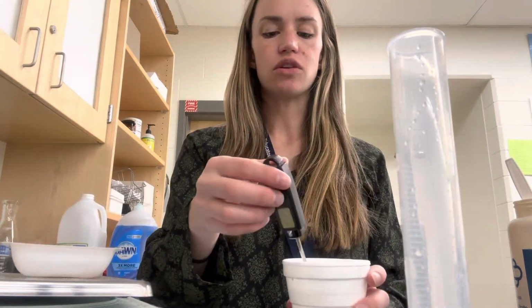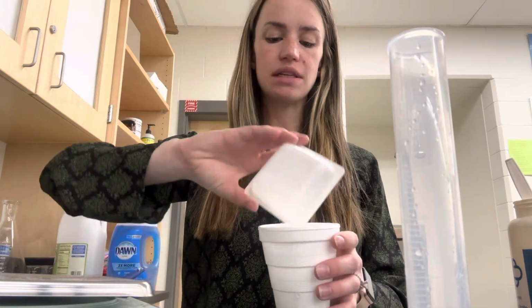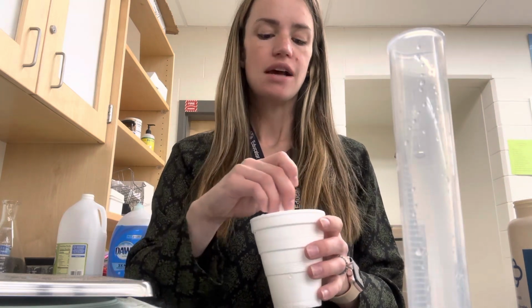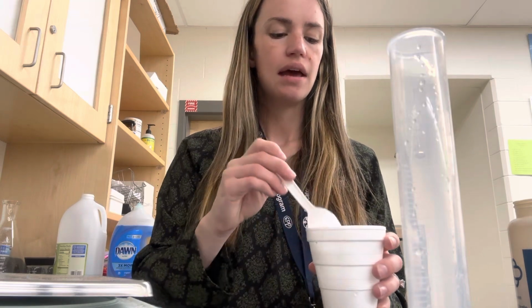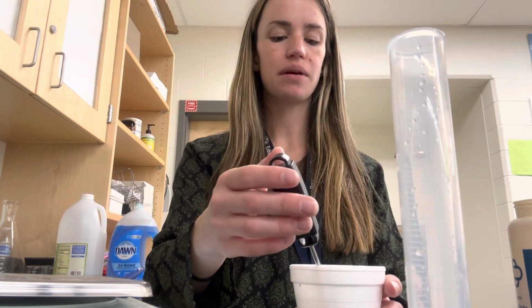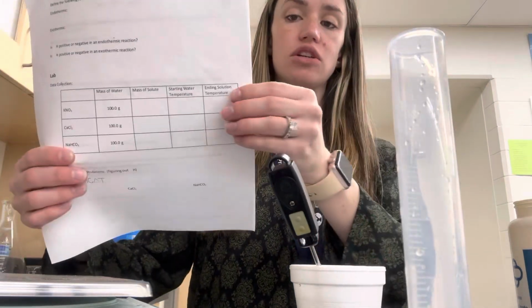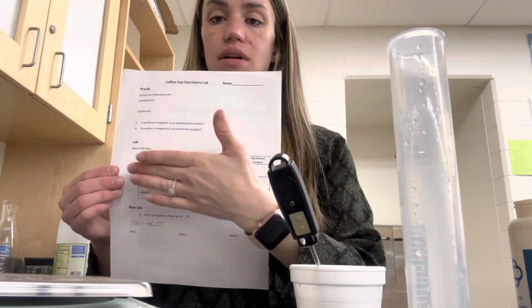Then I'm going to take the powder and dump it in, and I'm going to mix it around. All right, and then this is causing a chemical reaction to occur right now. So I'm going to make sure I dissolve it, and then I'm going to stick in my thermometer, and I'm going to let it sit for a little bit, and I'm going to see if the temperature is going up or going down. And based on that, I can decide if it's endothermic or exothermic. So I'm going to let this sit for a little bit, and like I said, I'll take a picture of what the ending temperature is, and then you will use the pictures and fill out the ending temperature part on your lab sheet. All right, so you're going to be doing this for 3 different ones.